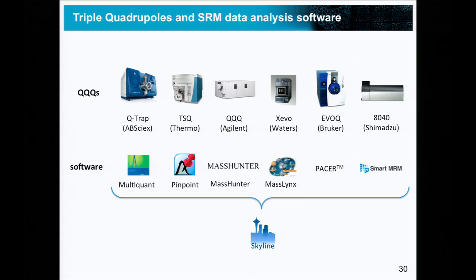Okay, so now let's have a look at how you can reliably identify a peptide from your SRM data. There are actually 6 criteria that you can apply in order to make sure that you're really measuring what you think you're measuring. The first criterion we discussed already. If you measure several transitions for a peptide of interest, then all of those transitions should perfectly coelute because they all originate from the same peptide, so they all should have the same chromatography. As on the column, you still have the peptide unity, right?